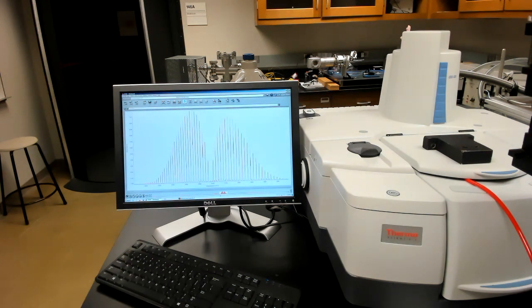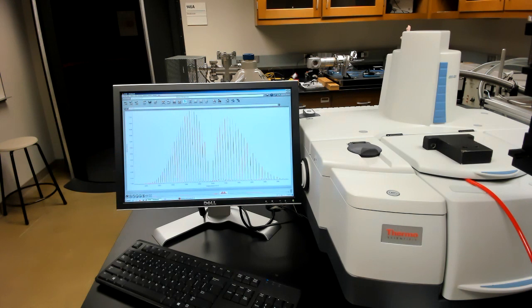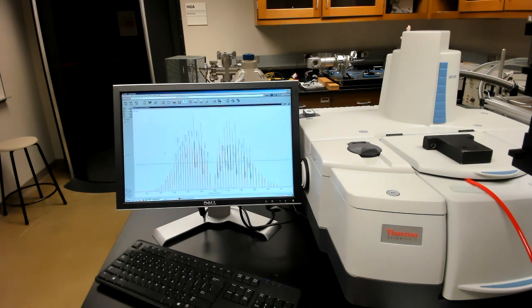Very good. Now, the last thing that we'd like to do before you can start really analyzing the data is we'd like to know the location and the strength of each of these lines. Now, we can measure them separately, one by one with a cursor, but that would be very time-consuming. Luckily, there's a routine built into this program called Find Peaks, and we'll use that now. This has a peak finder, which will look for the sharp features and then label them.